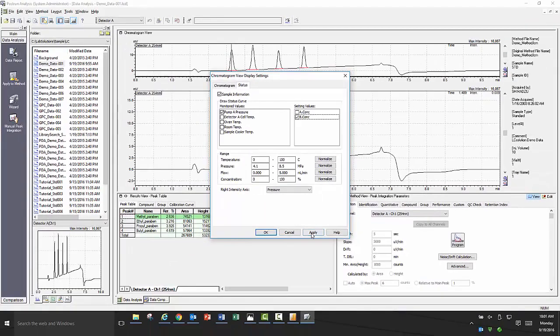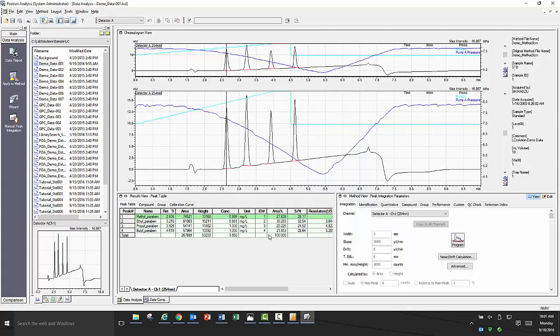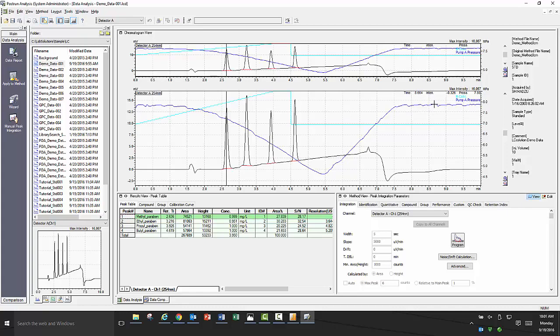In this case, I am overlaying the gradient time program of pump B as well as the pump A pressure. Now that the traces are overlaid with the chromatogram data, you can see the power of analyzing your data with all of this information viewable simultaneously. You can see where your peaks are eluting off in relation to your gradient and how the pressure of your pump is varying with the gradient throughout the run.